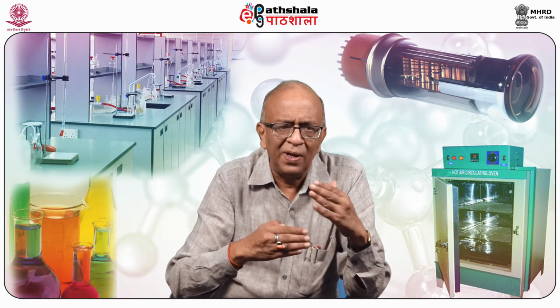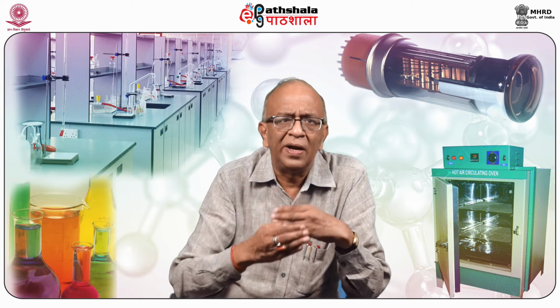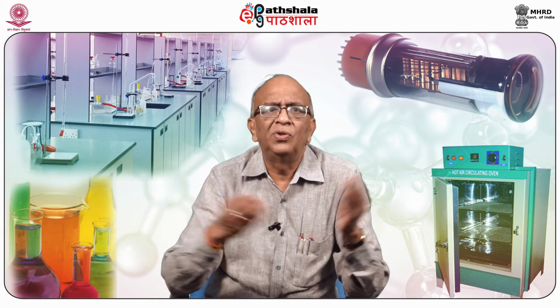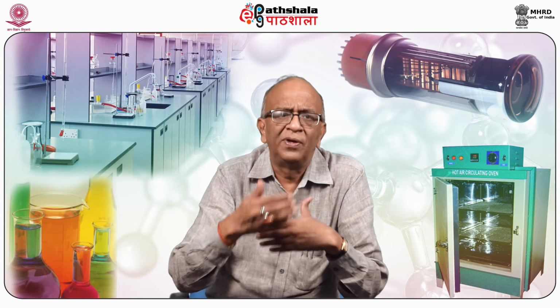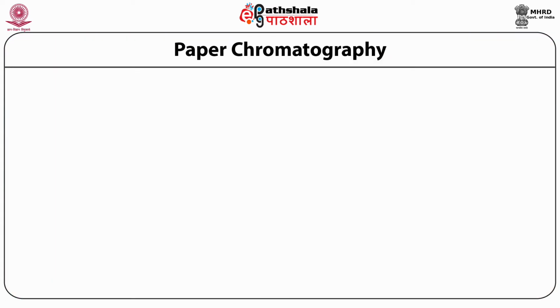In case of paper, it is the cellulose fibers on which water vapors are held tightly, which works as the stationary phase. Then both the plates or paper are put in a jar and developed using the mobile phase. The first chromatography we shall study in detail is paper chromatography.